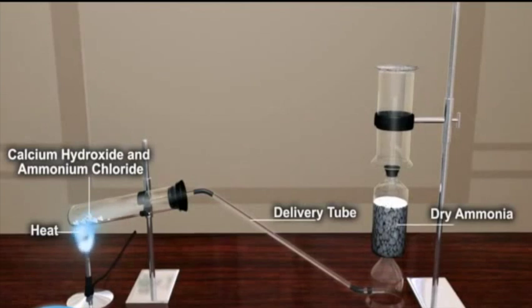Apparatus that we require: In this experiment, we require clamp, Bunsen burner, delivery tube, etc.